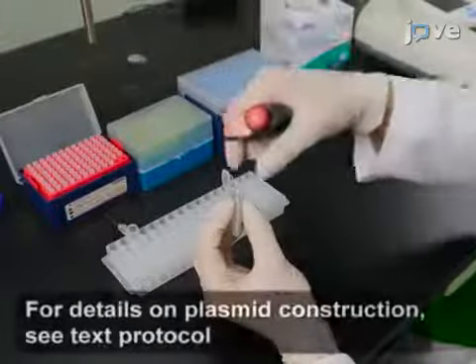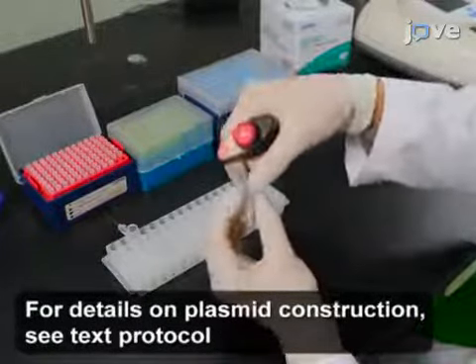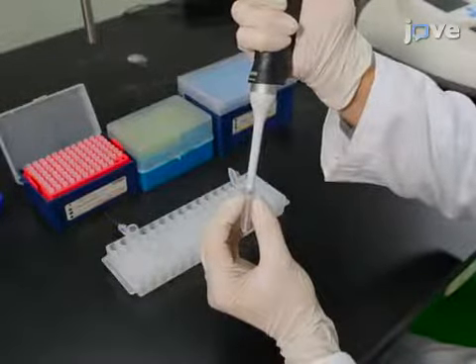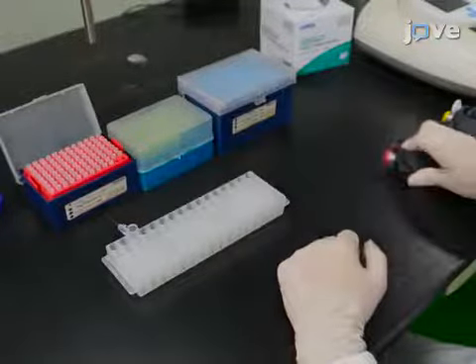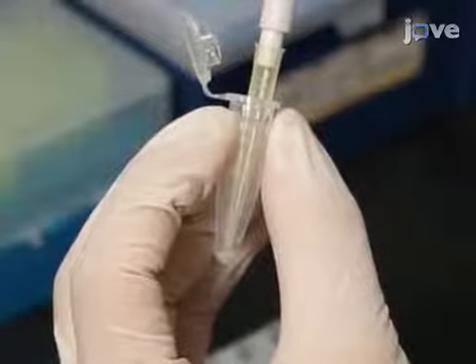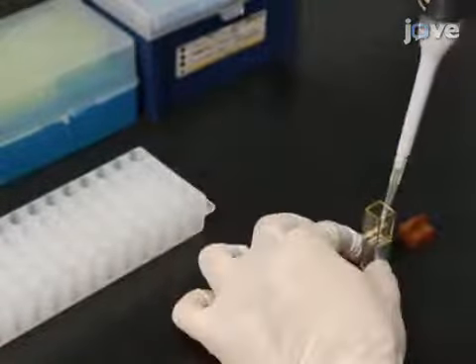After constructing the plasmids, add 1 microliter of each to 20 microliters of E. coli strain DH10 beta at a concentration of 2 × 10⁸ cells per microliter to a 1.5 milliliter centrifuge tube. Use a pipette to gently mix the solution. Then place 20 microliters of the mixed solution into a clean cuvette.